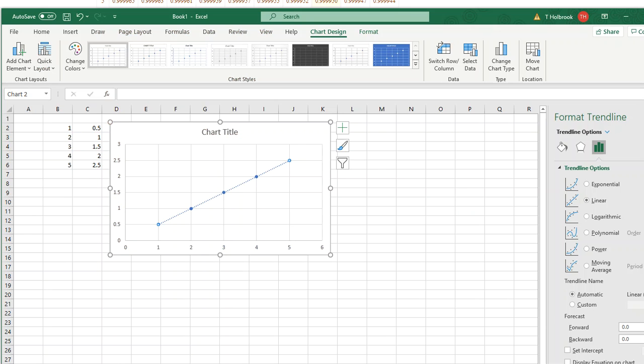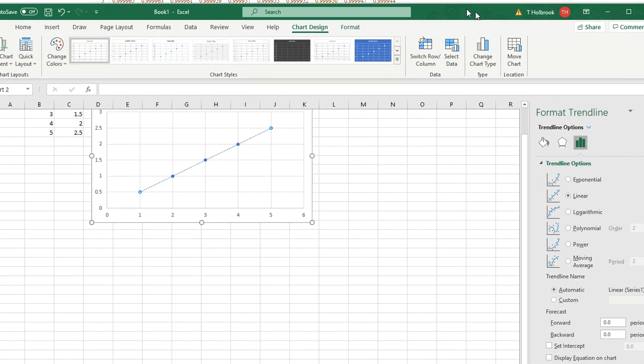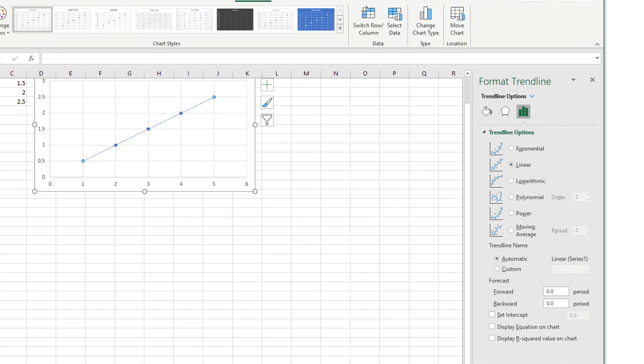And then I'm going to scroll down that box. Let me pull it back up again. I'm going to go down, pull it back up a little bit. And here at the very bottom, you're going to see an option that says Display Equation on the chart. Well, we need that equation. That slope is going to be my density value. So I'm going to hit check.